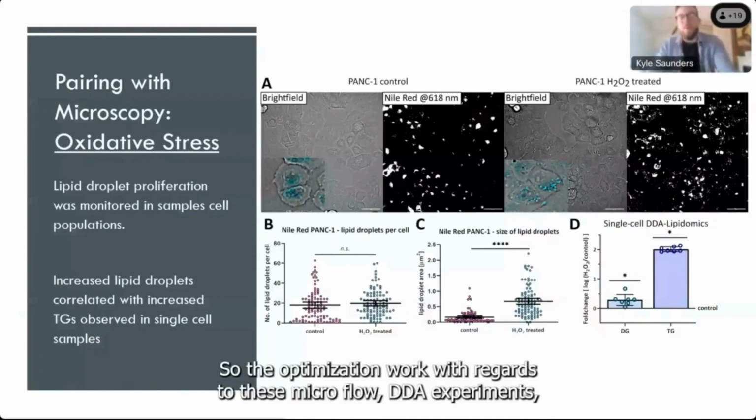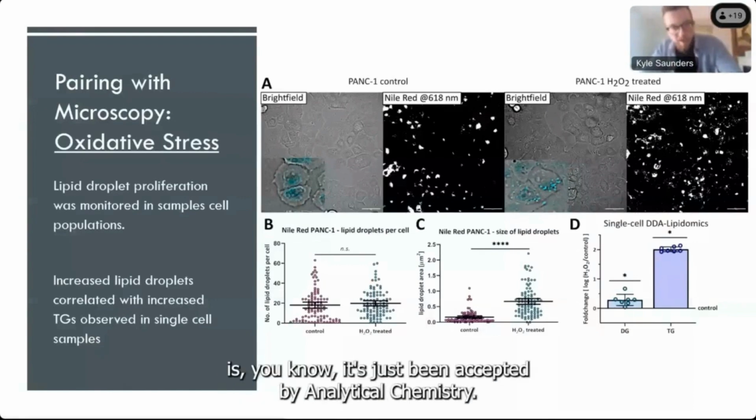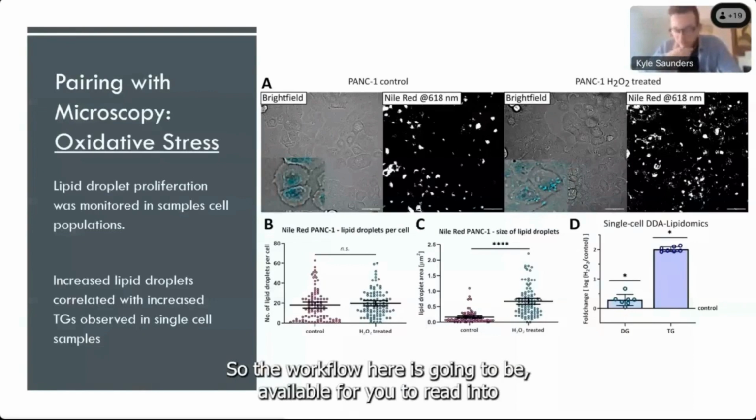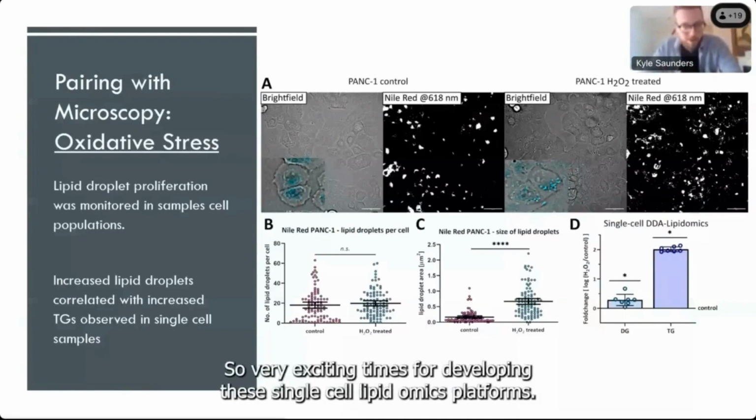So the optimization work with regards to these microflow DDA experiments and the experiment I've just shown has just been accepted by Analytical Chemistry. So the workflow is going to be available for you to read in a bit more detail, I believe within the next week. So very exciting times for developing these single cell lipidomics platforms.